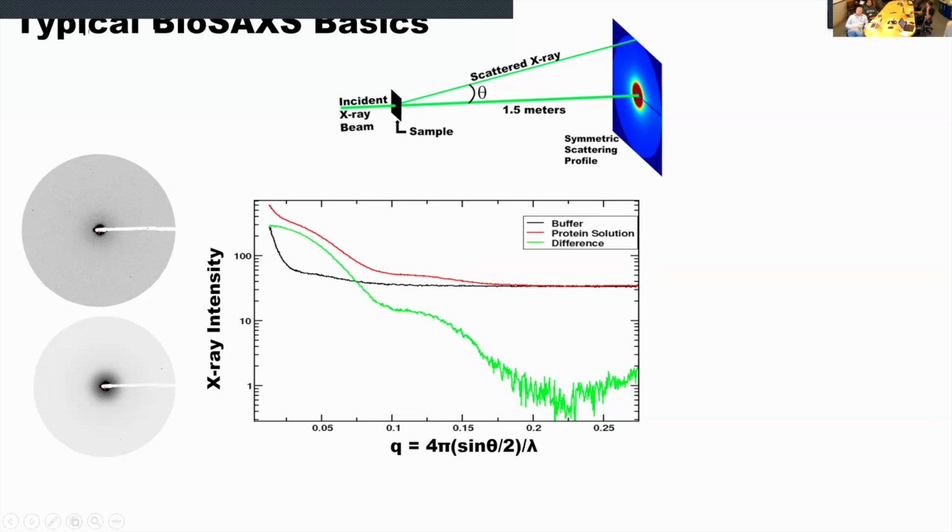You typically plot it on a log scale, okay? And that will mess with your general sensibilities, right? We don't think in log often, so things that you see, you have to understand that it's on a log scale, and these differences are very small. We plot the data as X-ray intensity versus scattering angle, theta. Now, we've manipulated theta to be Bragg law-like, so we've manipulated it into a formula like this, and we've put the wavelength here that we're collecting at.